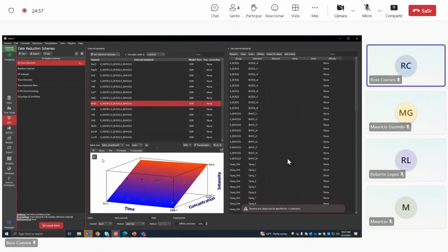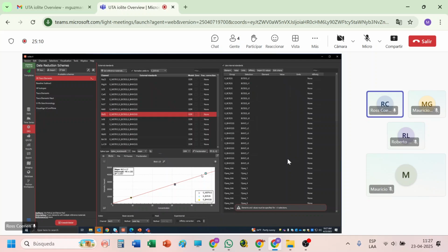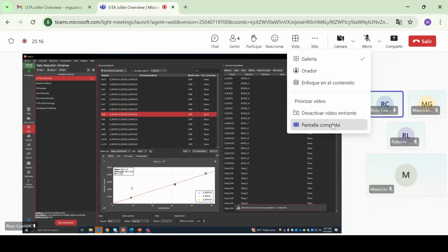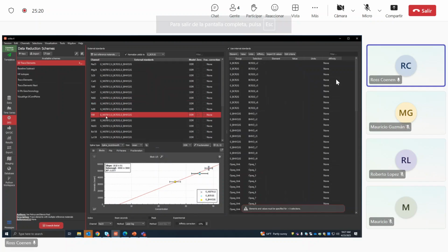From there, we can look at our calibration curves and blocks. So we see the X here is NIST 612. The plus sign is the BCR2G. And this little yellow dot down here is BHVO. So we've got a pretty decent calibration curve, 0.997 for the R squared.